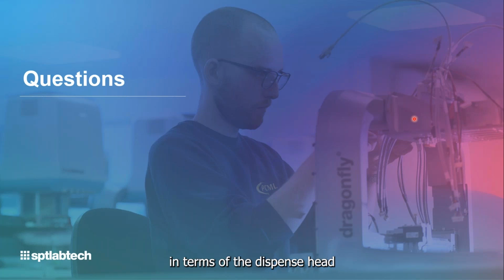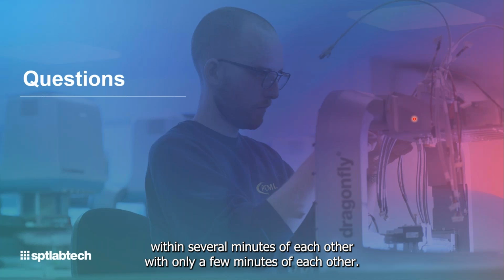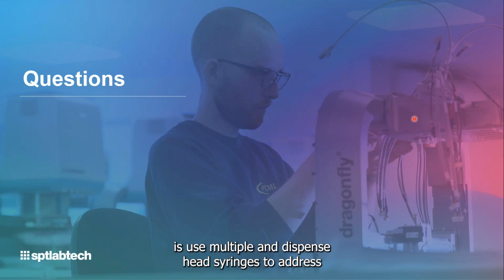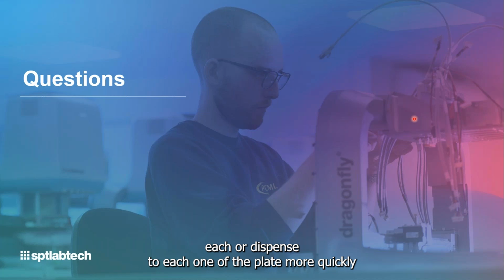In terms of the dispense head, each well is addressed within only a few minutes of each other. So there aren't likely to be too much of a time delay to show any sample variation. What we can do also is use multiple dispense head syringes to dispense to each well of a plate more quickly. So that's the way that we can address any time delays there.